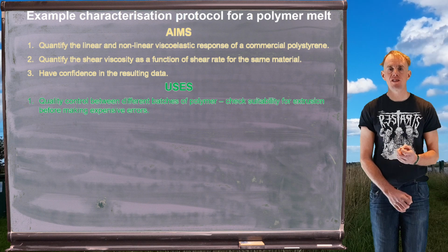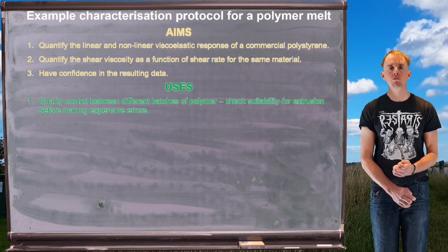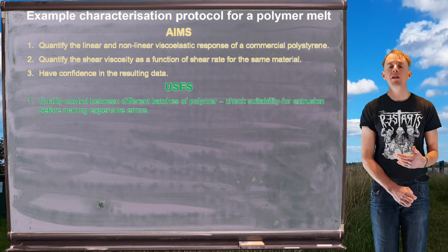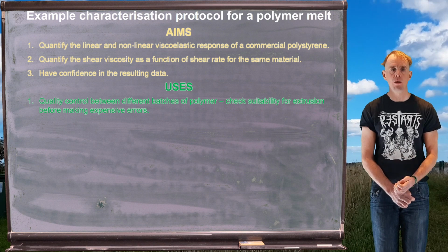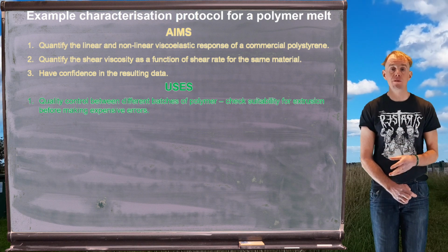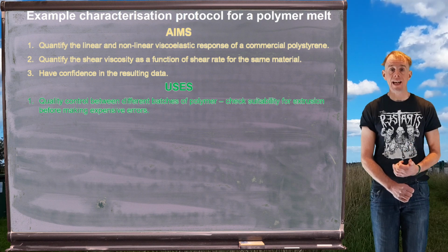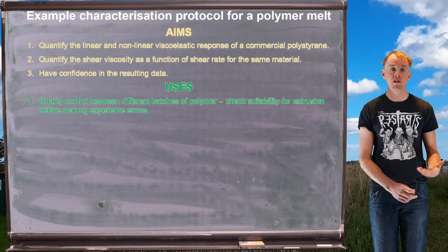So the architecture molecularly of the polymer, which we know affects the macroscopic rheology, is going to strongly determine whether, in the most extreme case, these materials extrude or not, but more pertinently, how stable they're going to be and whether you're going to get the kind of product that you want. So looking at the viscoelastic fingerprint of the material that you're using in these lines enables you to make a very good judgment as to whether or not that material is A, going to work, and B, is consistent with materials you've processed on that line before.